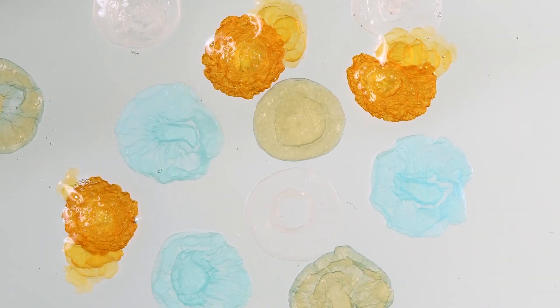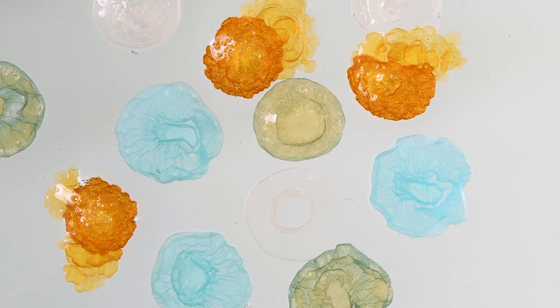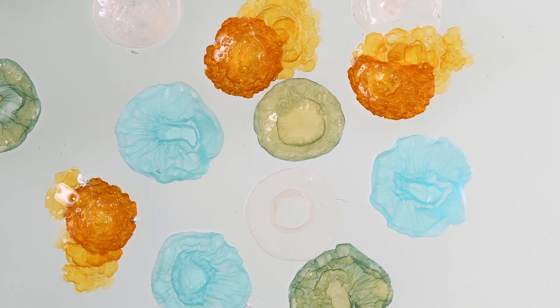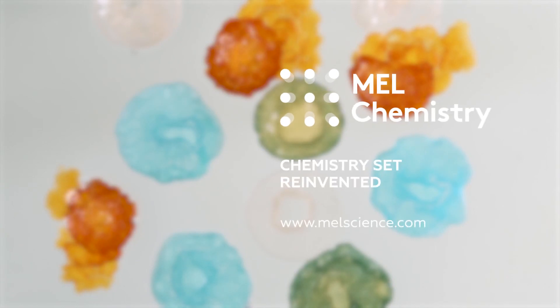Manganese sulfate gives white jellyfish, ferric chloride red, ferrous sulfate green and copper sulfate the blue ones. Learn more about this experiment on our MEL Science website.